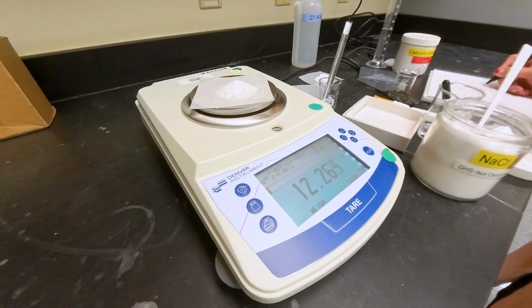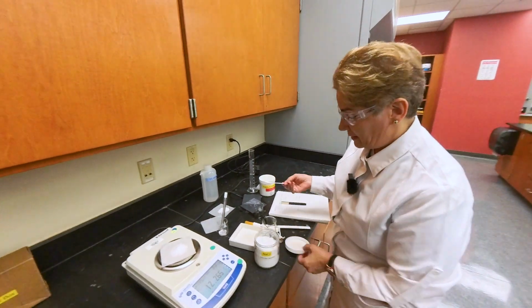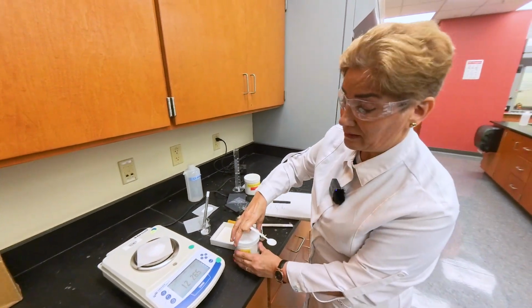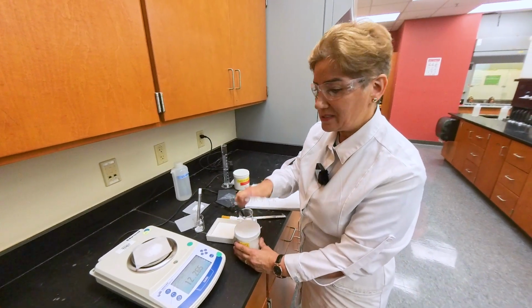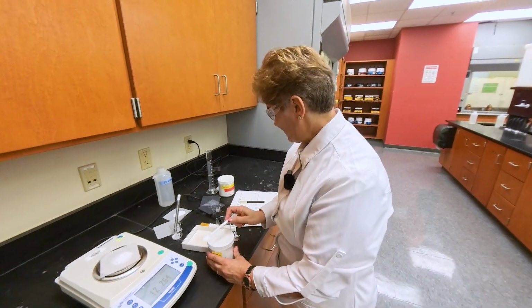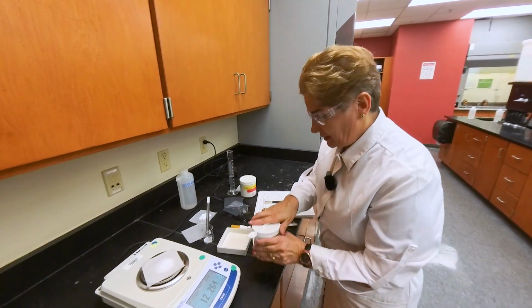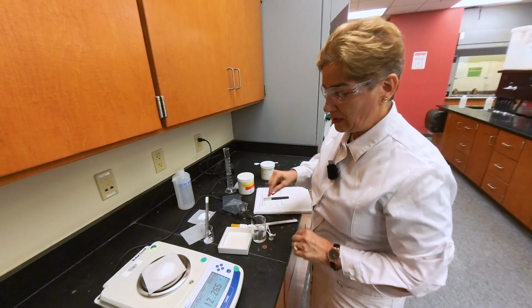Please note that after you do the calculation, the mass for the first, second, and the third spoon may not be exactly the same, because a spoon is not an accurate measuring device. And that's for the measuring by difference for the salt.